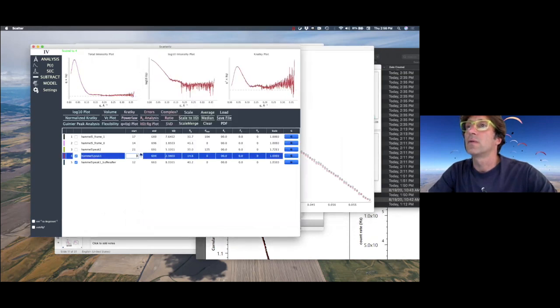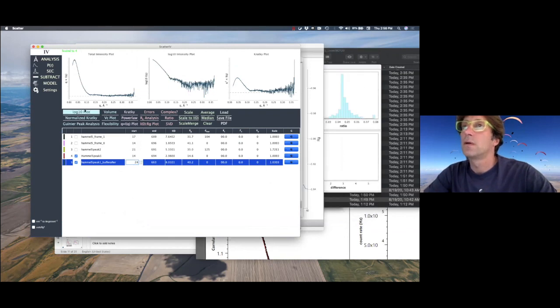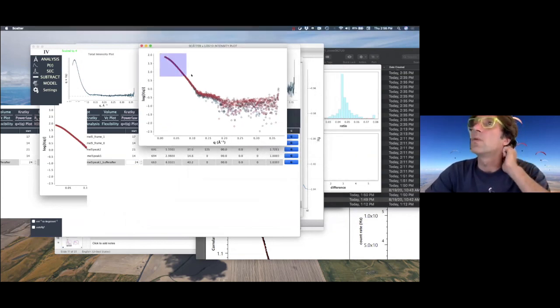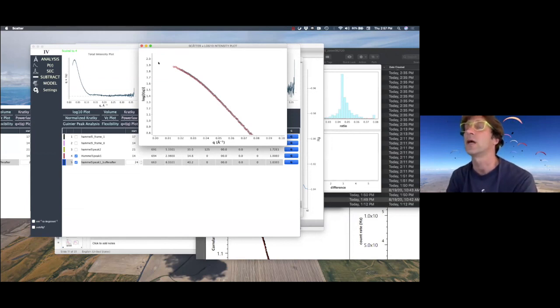So you're welcome to cut it as much as you want, as much as you want to be sure that you don't have a problem with drift or with those funky data on the top. In this case, we are allowed to do that because we have so much data here that we never use, especially for something that is 120 or 200 angstrom large.